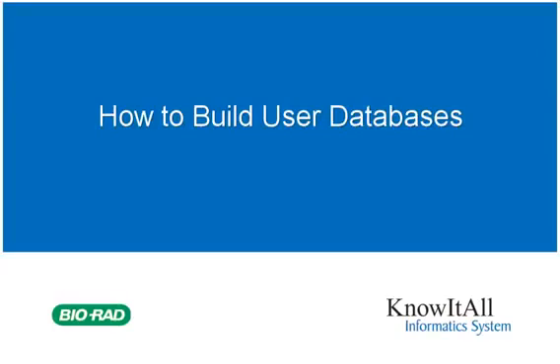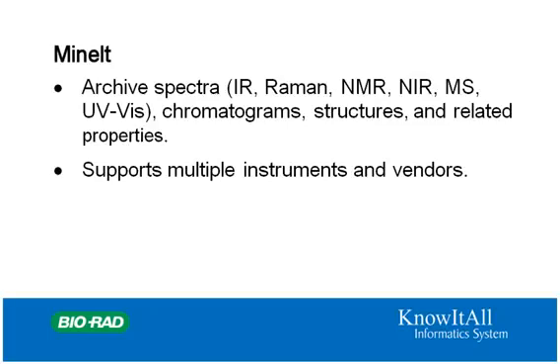Welcome to a demonstration on how to create user databases. With Bio-Rad's KnowItAll software, you can build databases with spectra, chromatograms, structures, and properties. The software supports file formats from multiple instruments and vendors.